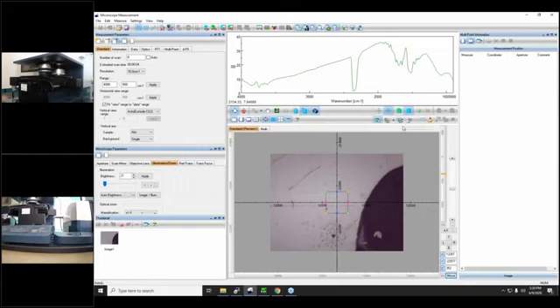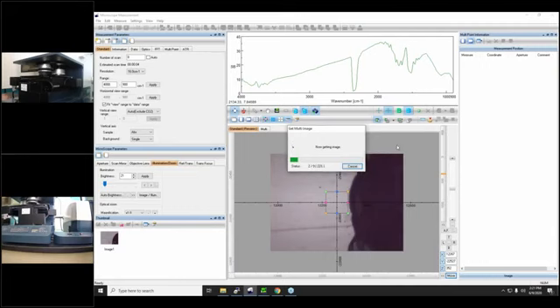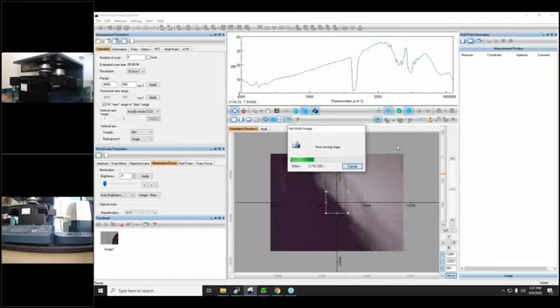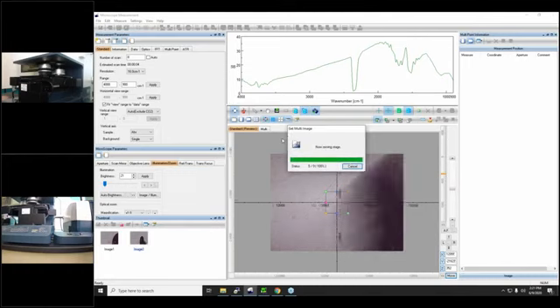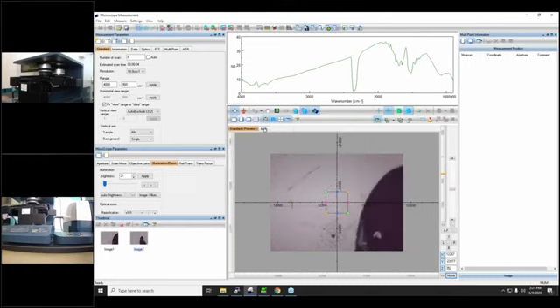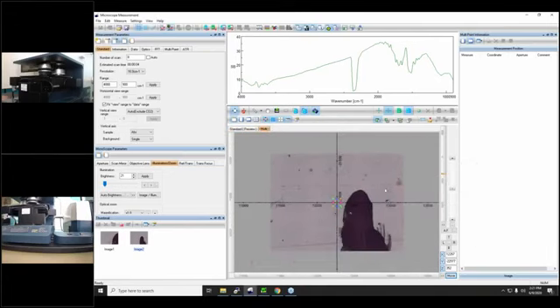One of the really useful features is the multi-image, and we can decide to make, for example, a mosaic. I just decided to make a mosaic of 3x3. That is 9 images that have the same field of view as the standard preview that I was looking at. Now that we have this mosaic, we can look at it here in the multi-image. I can change the size of this image.